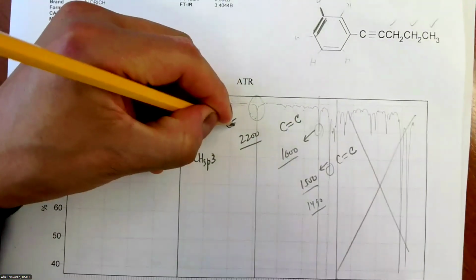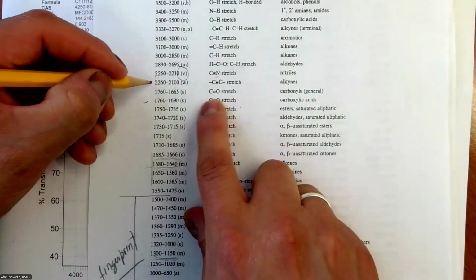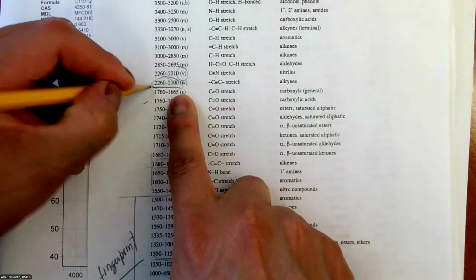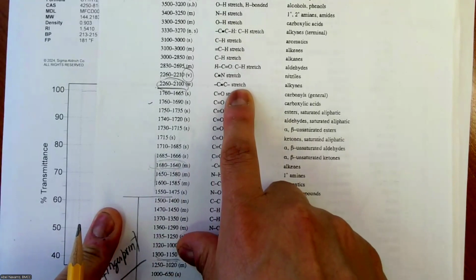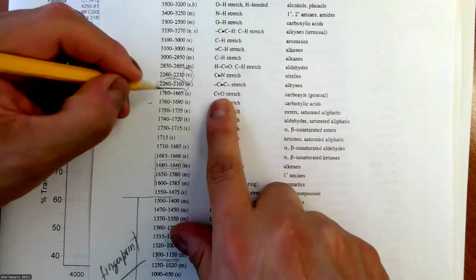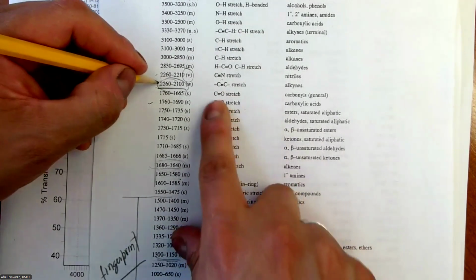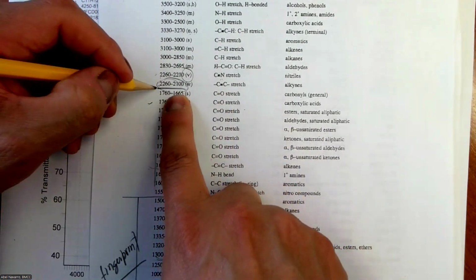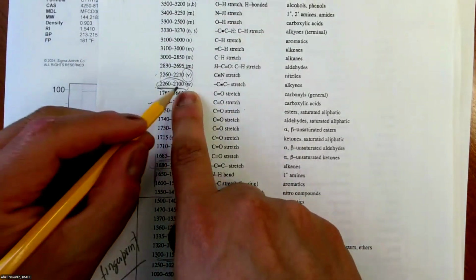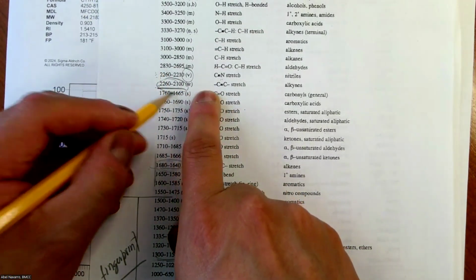That's the C-triple-C. How do you know that, Professor? Again, the table: who is in 2200? I have this guy, C-triple-C. What else could it be? A C-triple-N. How do you differentiate between a C-triple-C and a C-triple-N? Well, first, C-triple-C is a little bit lower, around 2100. This one is a little bit higher, 2200. You say, yes, Professor, but they overlap a little bit. Yes, they do overlap.